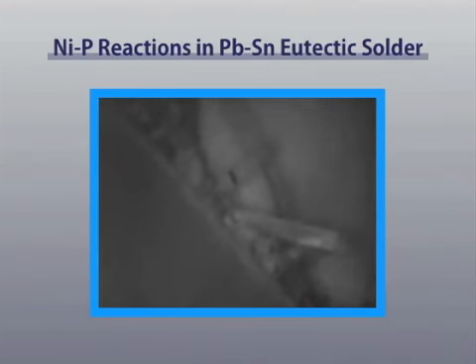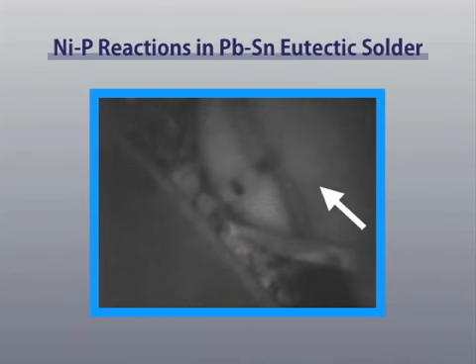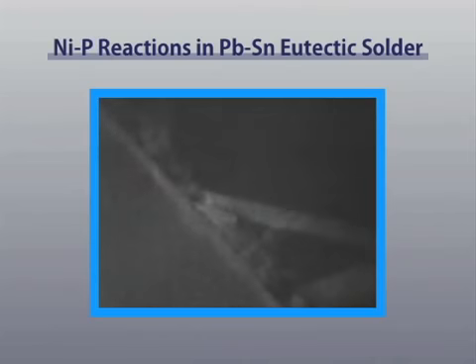The solder alloy is still solid. Now, it melts. The liquid here has a very uniform contrast. All of a sudden, the interface becomes busy. Large columnar crystals are formed one after another. Thickness in the white area increases as well. This is the real process of solder joining, observed in the nano world.